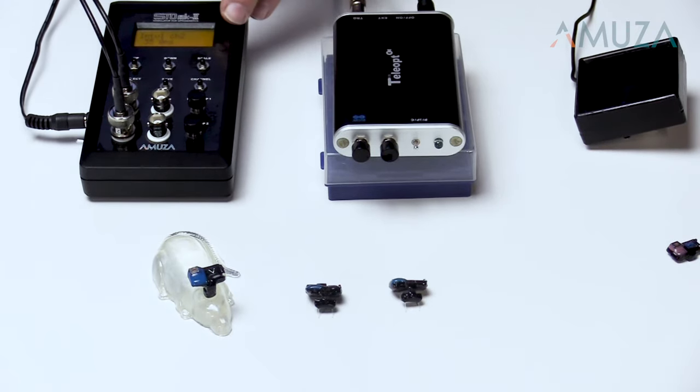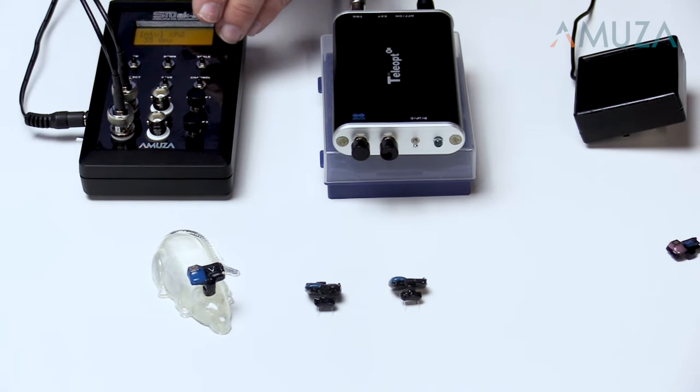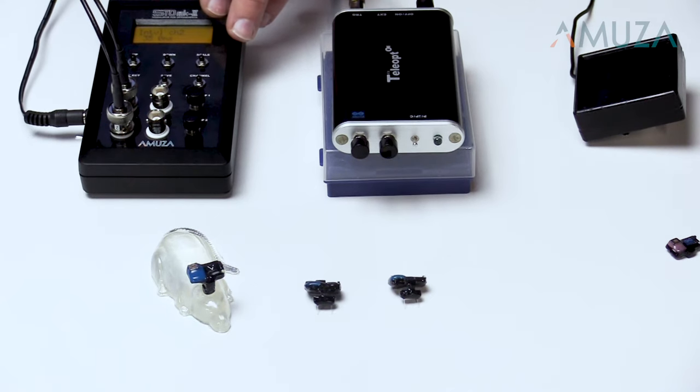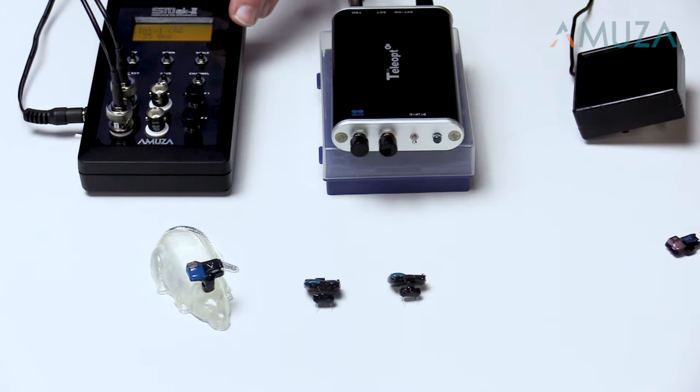The pulse generator in turn can be triggered by behavioral events. A nose poke, lever, video tracking system, or other equipment can easily be used to trigger the start or stop of a pulse train. Amuza can work with you to make certain your behavioral equipment is compatible with Teleopto.